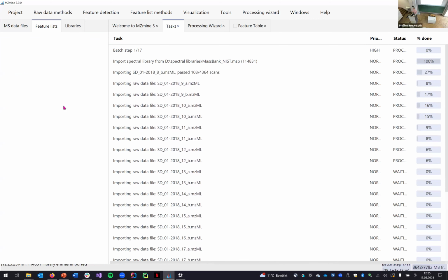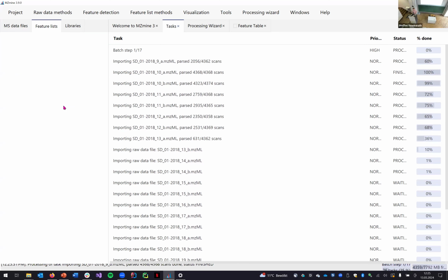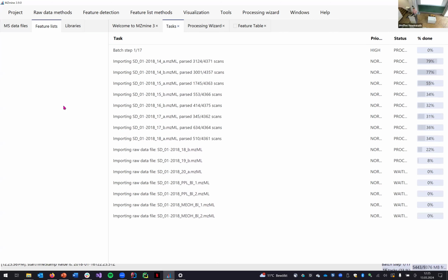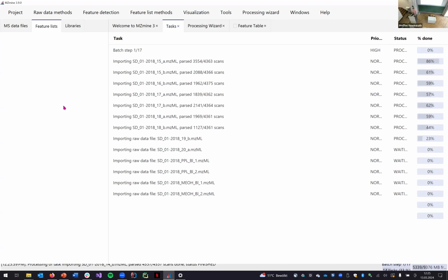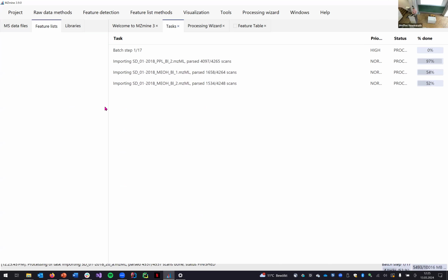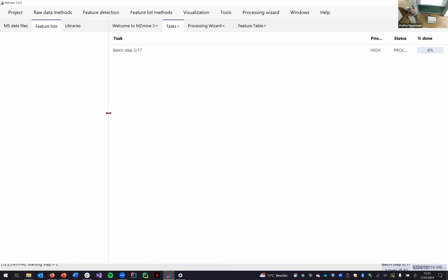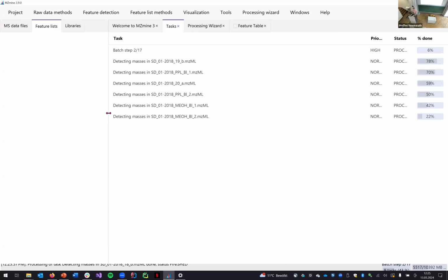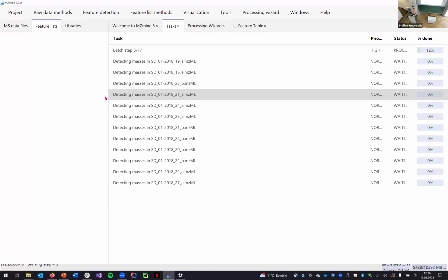which is also why we have uploaded the results to the shared folder. Because especially Marcus with Sirius, he will be looking at the MZmine results and using the exact export that we're using here. Maybe it's best, even if you processed it, to also download the results from the shared drive overnight, so we can use that for the remaining steps.